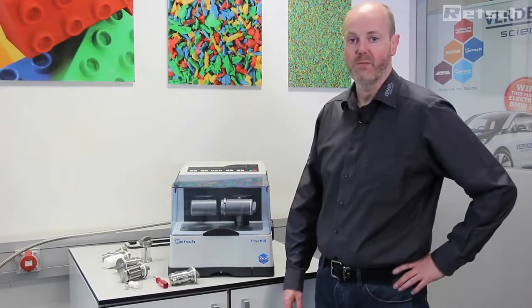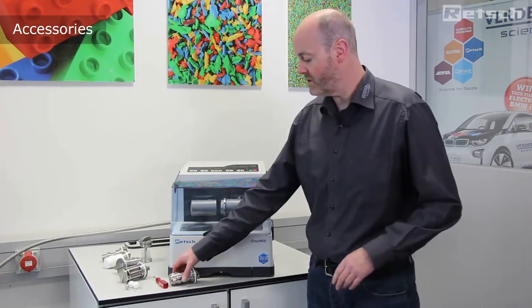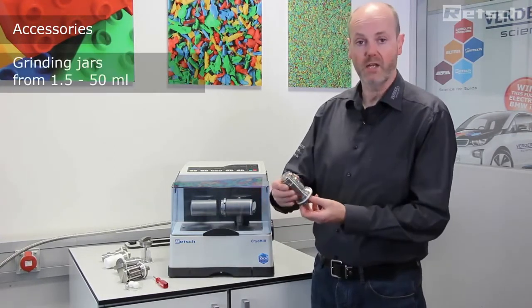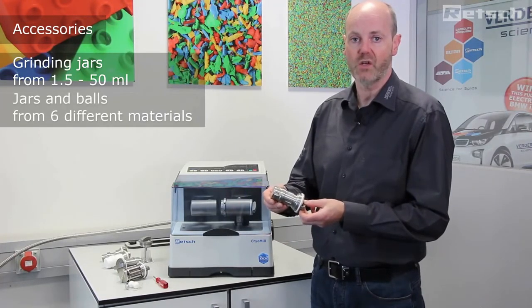The CryoMill instrument can be supplied with a very wide range of accompanying accessories to facilitate many different applications. For instance, we offer a wide range of grinding jars available in both metallic and non-metallic product contact surfaces.